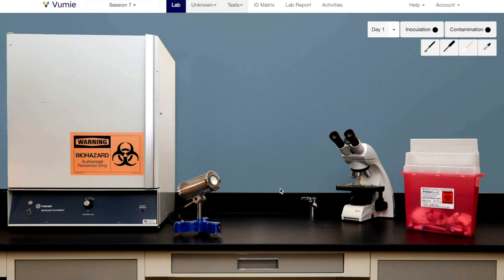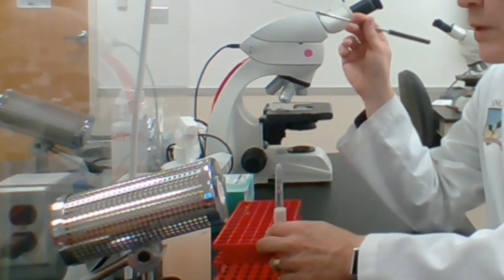This is a deliberate process that must be mastered to work in a microbiology lab. In a wet lab, this is done by picking up the tube of inoculum with the non-dominant hand to allow aseptic collection of growth on the sterile transfer tool.